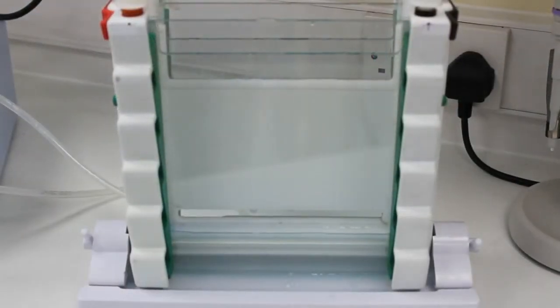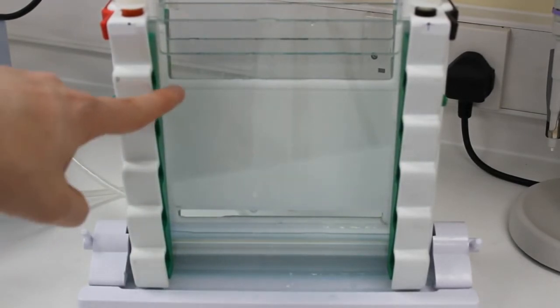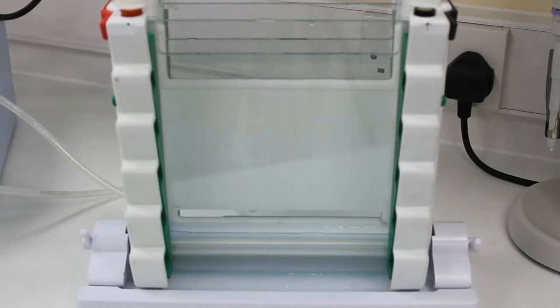So we've poured our gels, the first denaturing gradient gel, up to this level and now we're going to wait for this to polymerize and then we can add our stacking gel.